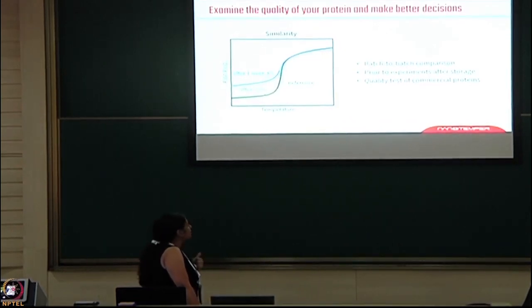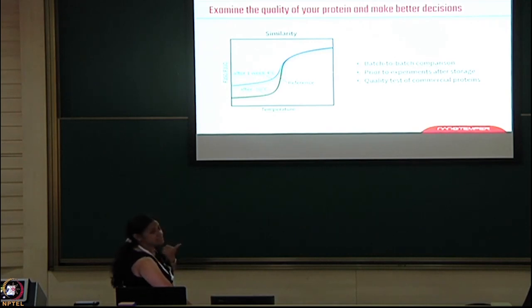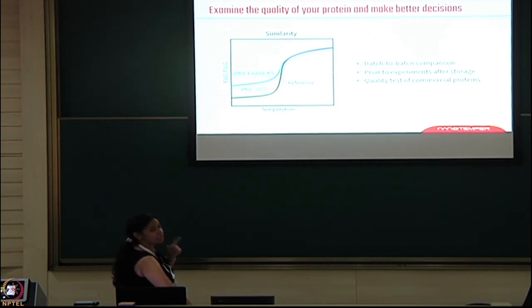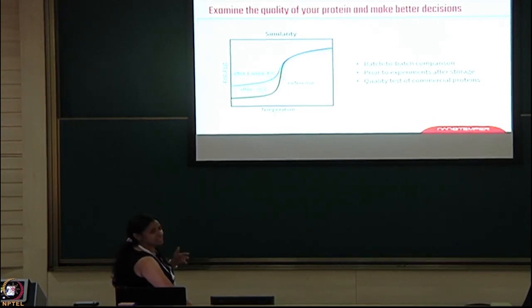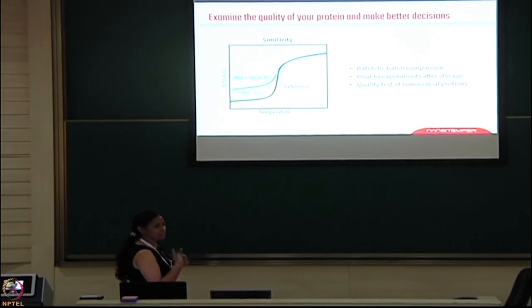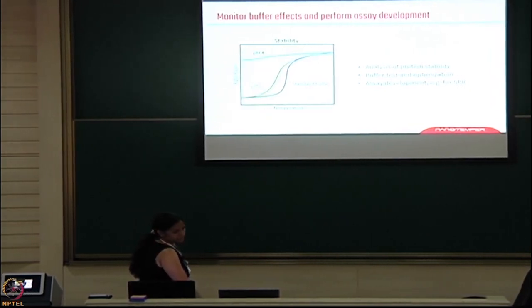Here is one example comparing batch-to-batch screenings. You can see the pure protein and the protein kept at minus 80 degrees are showing almost the same profile. But when used after one week at 4 degrees centigrade, the profile has changed — the shift has gone up, meaning the protein has slightly unfolded. So you can still go for assay, but you can check how the protein quality has varied.